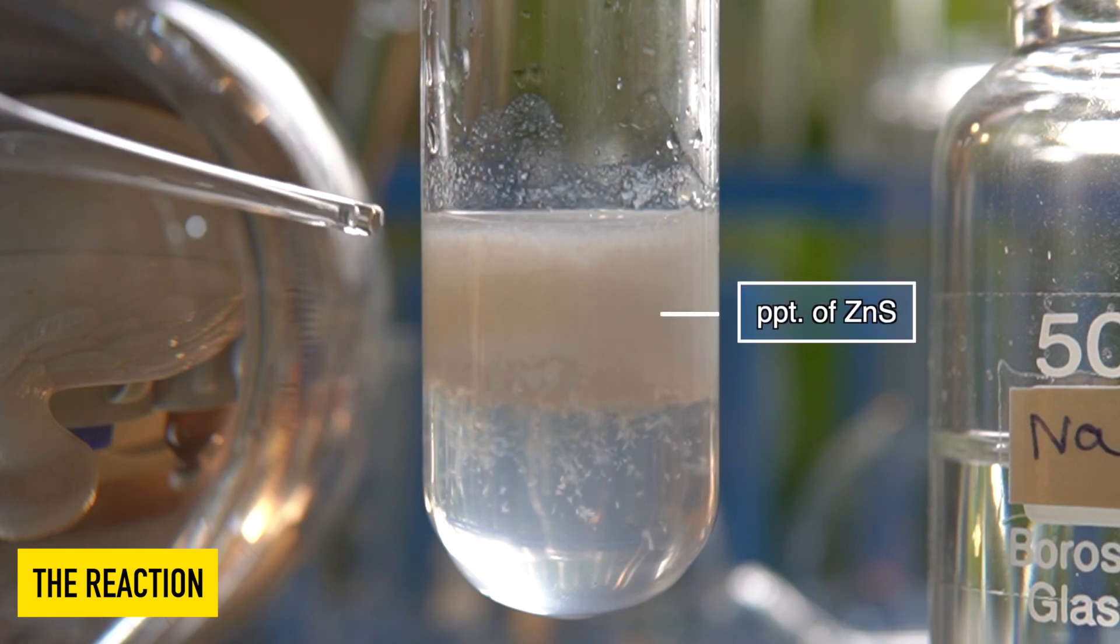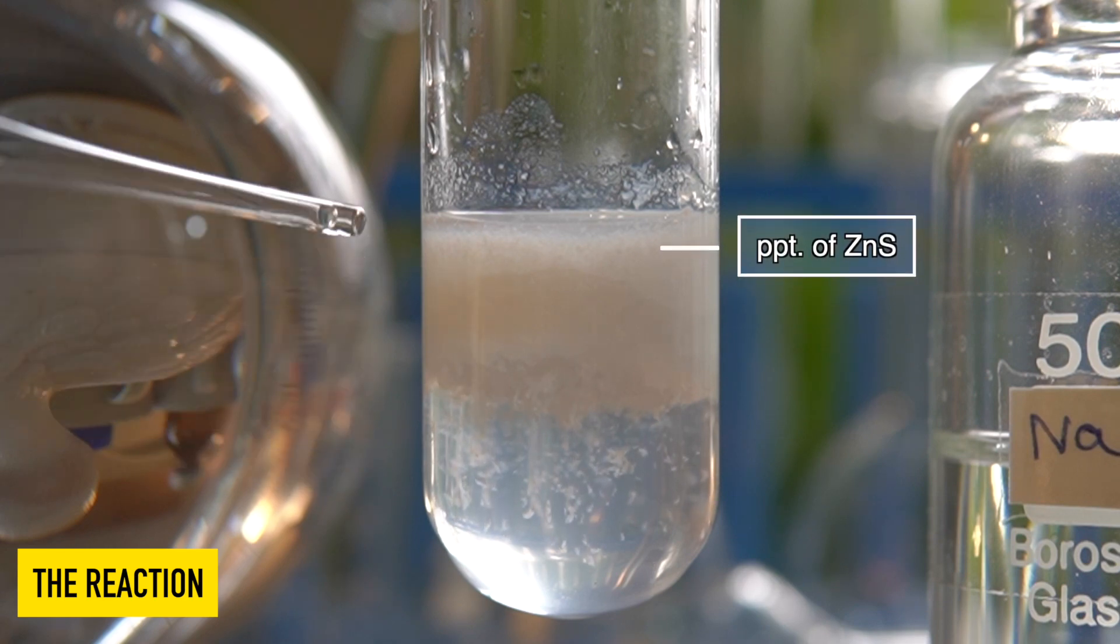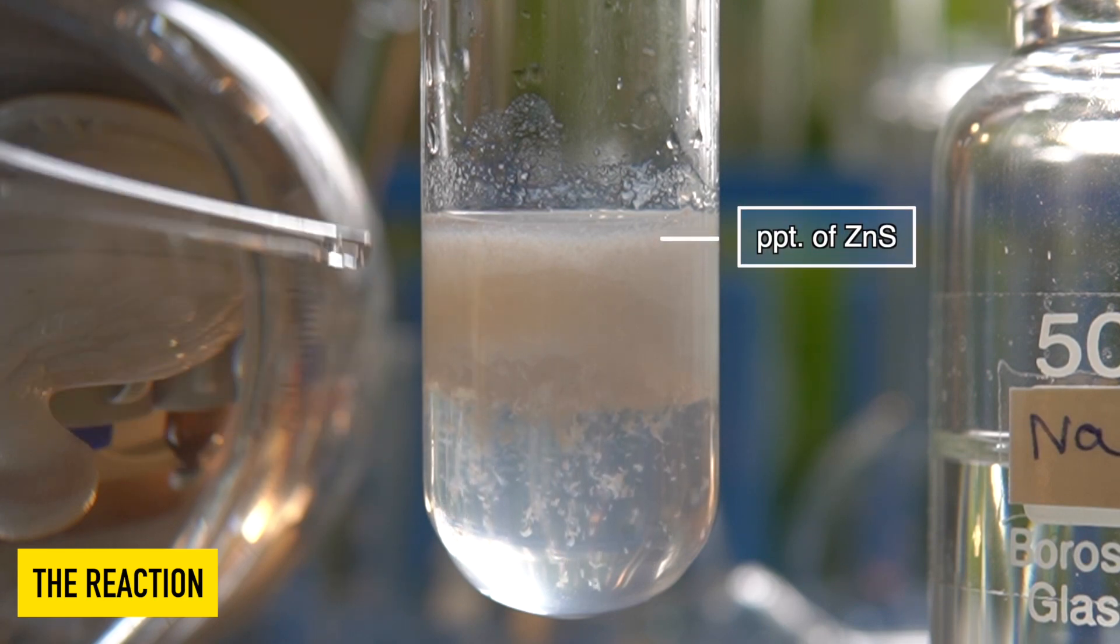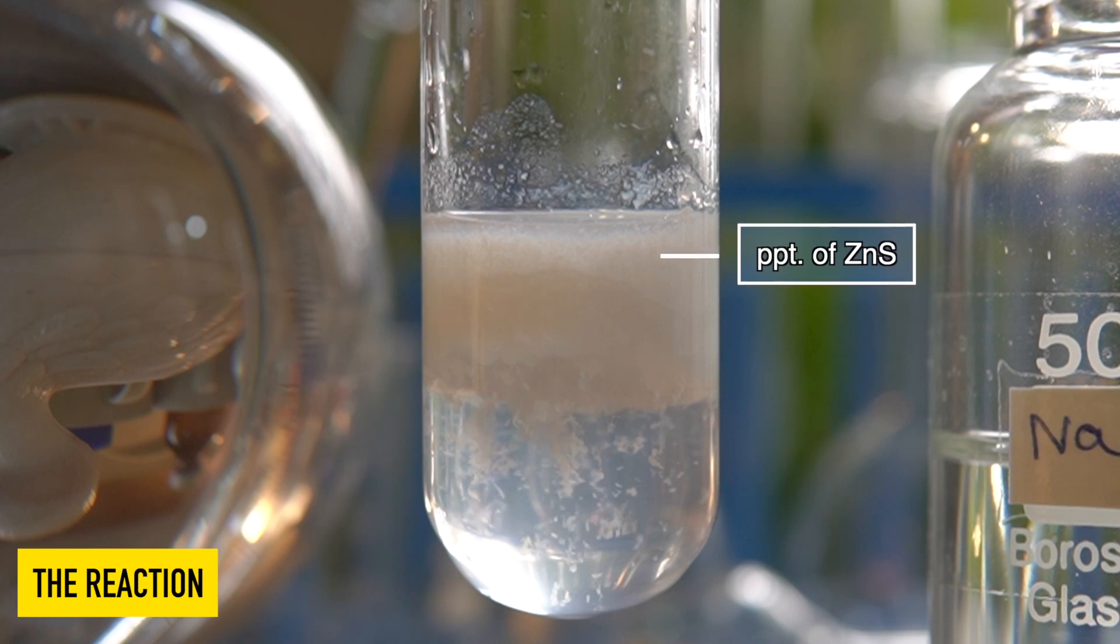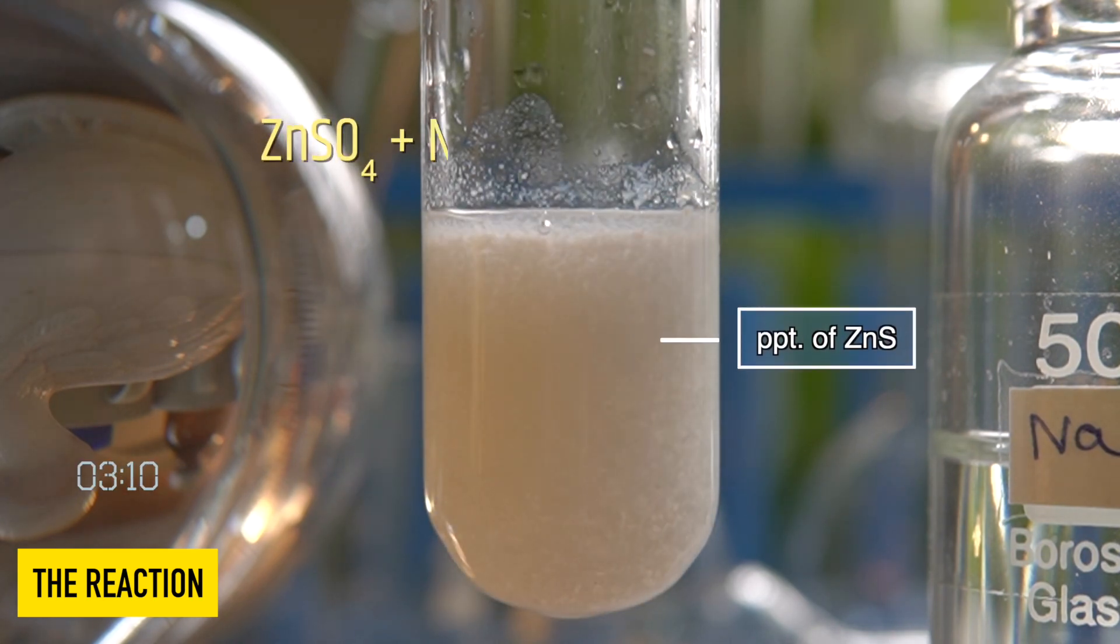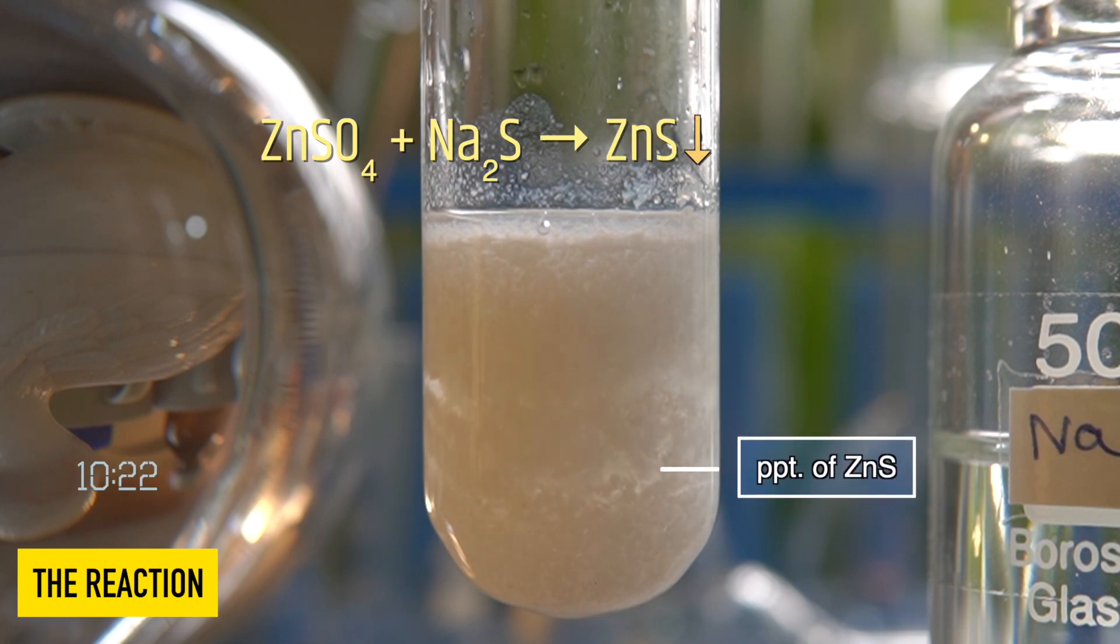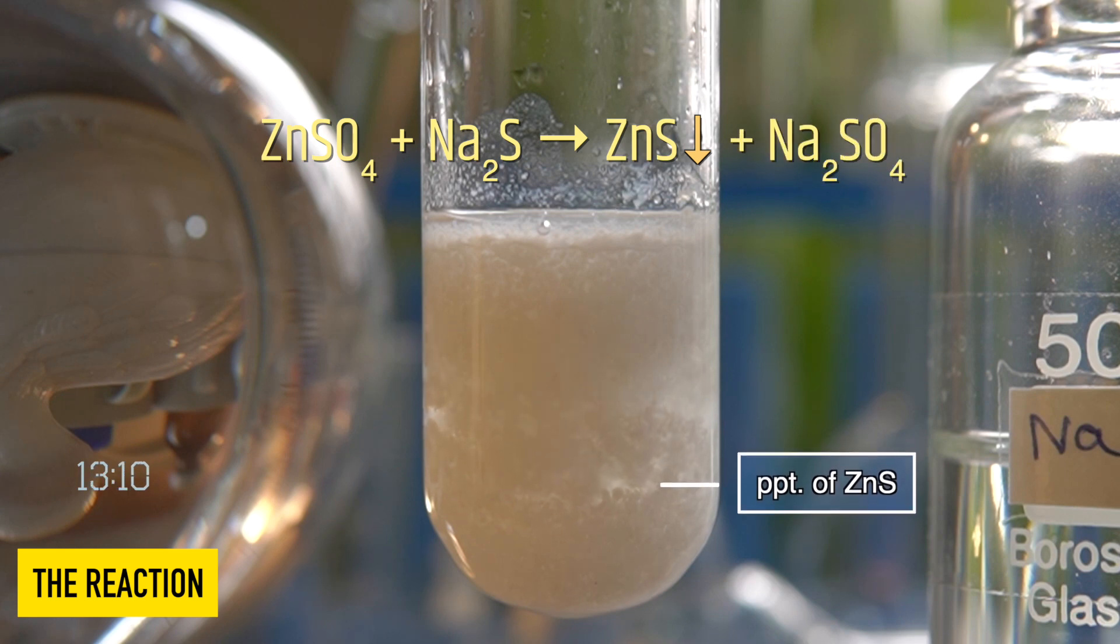The white insoluble precipitate that has been formed inside the test tube is nothing but zinc sulfide. So in this reaction, aqueous solution of zinc sulfate reacts with aqueous solution of sodium sulfide to produce a white precipitate of zinc sulfide along with sodium sulfate.